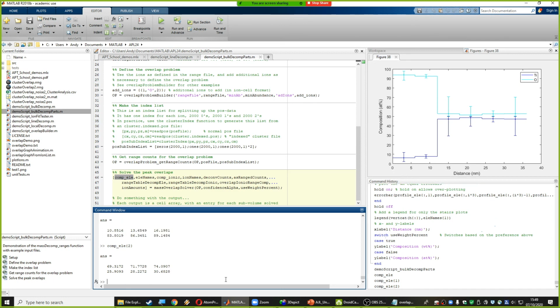If we look at the second cluster, here we've got much higher composition. It's confusing to me, but I guess maybe no, it's not ionic, it is elemental. Oh, there we go. I guess this is either my line profile's not great or this is doing something slightly different. But there we go. That's what you get for doing things live. It can backfire slightly. I sort of thought this would come out 50-50, but it didn't. Maybe it's looking at the noise or something.